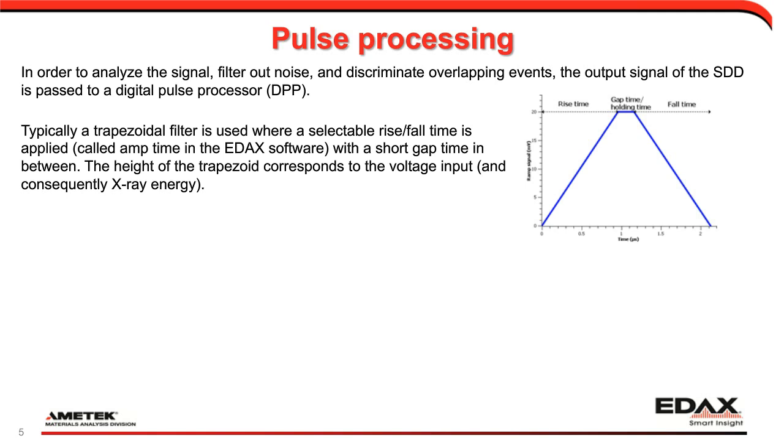But in the EDAX software, the amp time corresponds to the rise time, which is the same as the fall time. And the point of the trapezoid is that the height of it will correspond to the voltage input and then consequently to the X-ray energy.